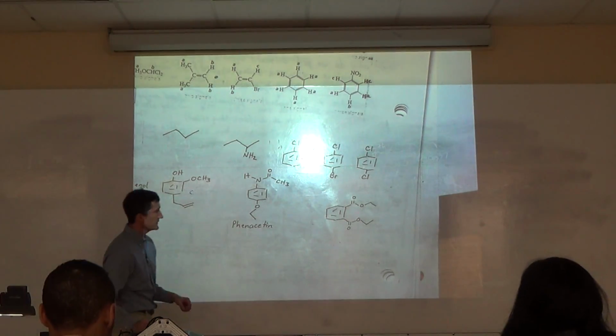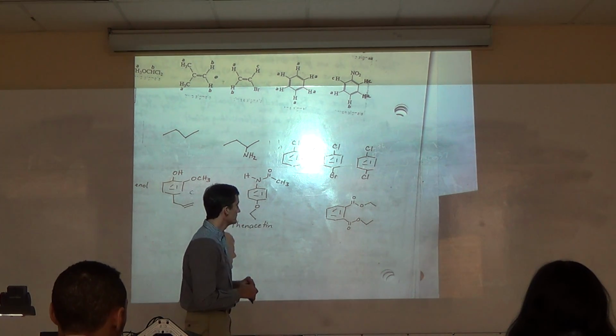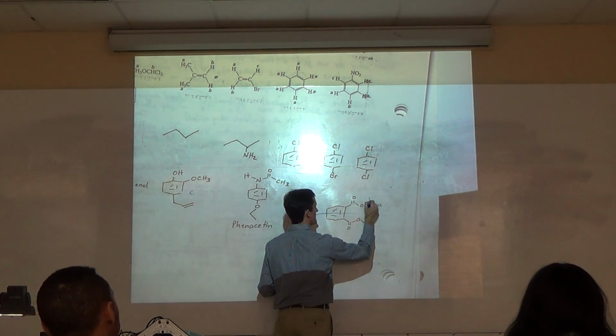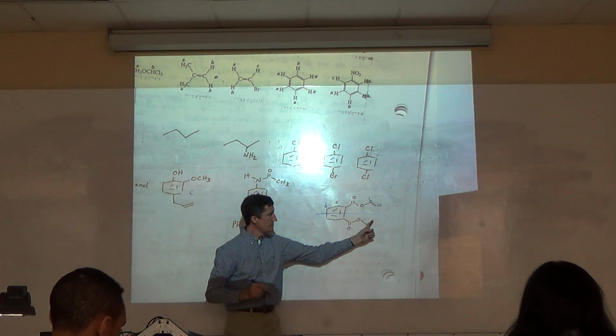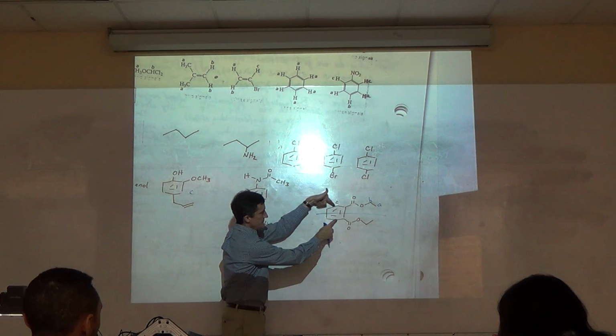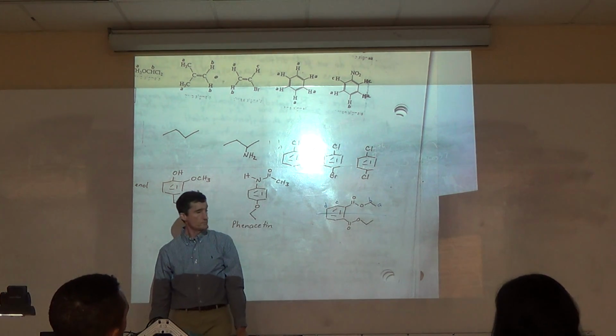How many proton signals did you come up with? 4. We've got symmetry here: A, B, C, D, and that's A prime, B prime, C prime, D prime. Same, same, same, same.